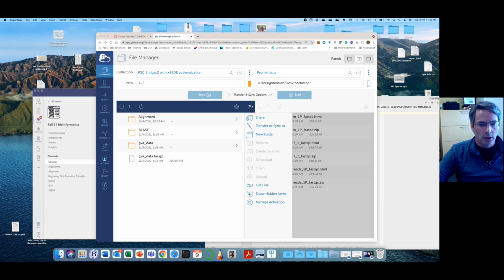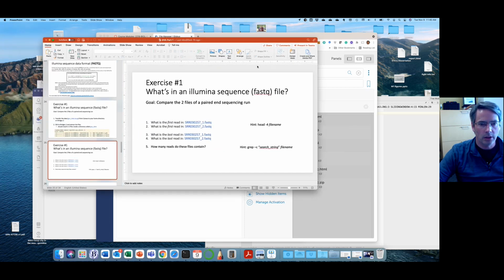Hopefully that goes smoothly. Next step, what's in the files? Remember how you look at those.